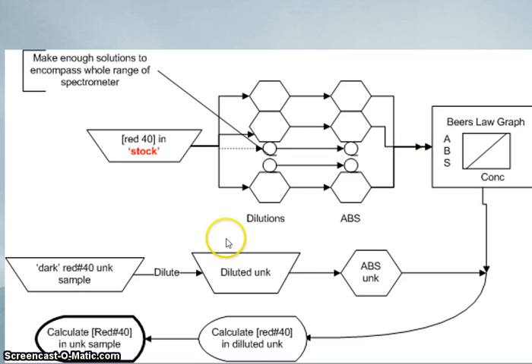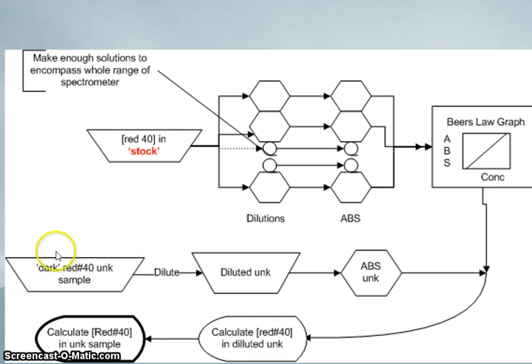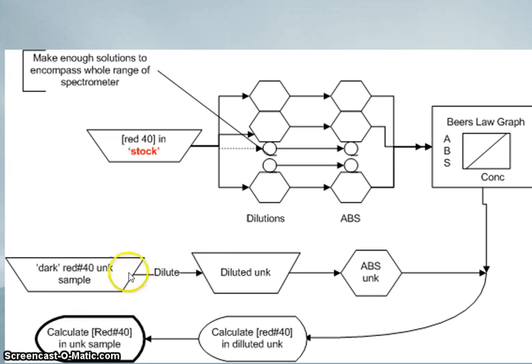A problem arises because our soda sample is going to be so concentrated that our spectrometer cannot read it — the absorbance will be greater than one, which is outside the range of the spectrometer. So we are going to take our Red Number 40 sample, which is too dark and too intense, and dilute it by a known amount. For example, I might put 2 milliliters of soda and dilute it to 10 milliliters, knowing the volume of how much I diluted it and what that ratio is.